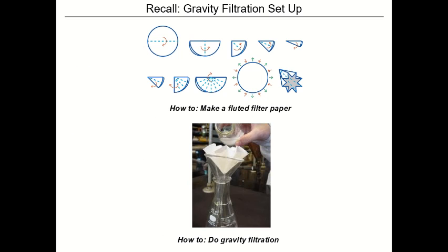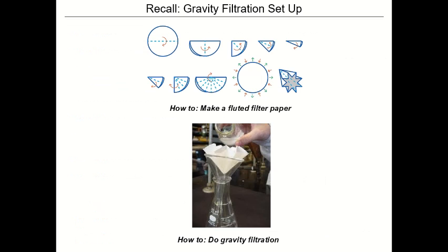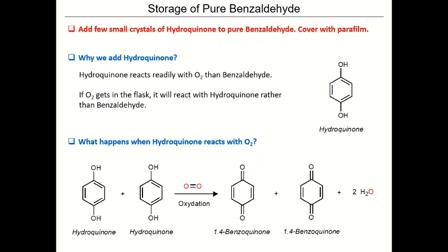That's this step. We have a suspension of the benzaldehyde, and we have to filtrate to collect the dry benzaldehyde. Finally, we have to add small amounts of hydroquinone.